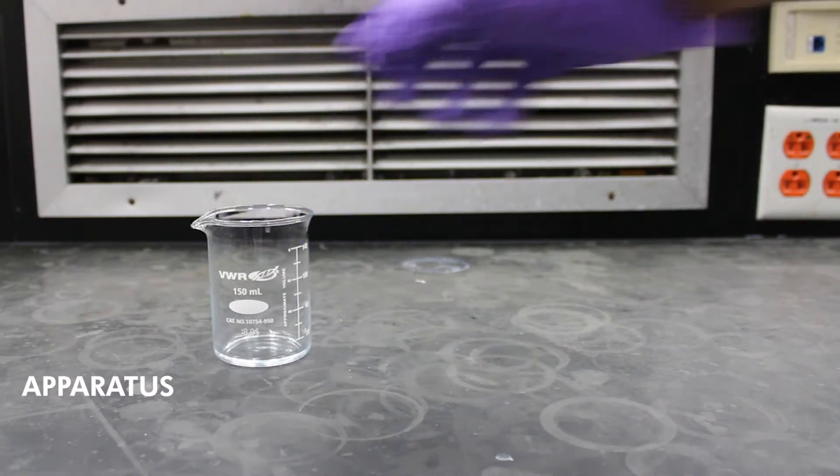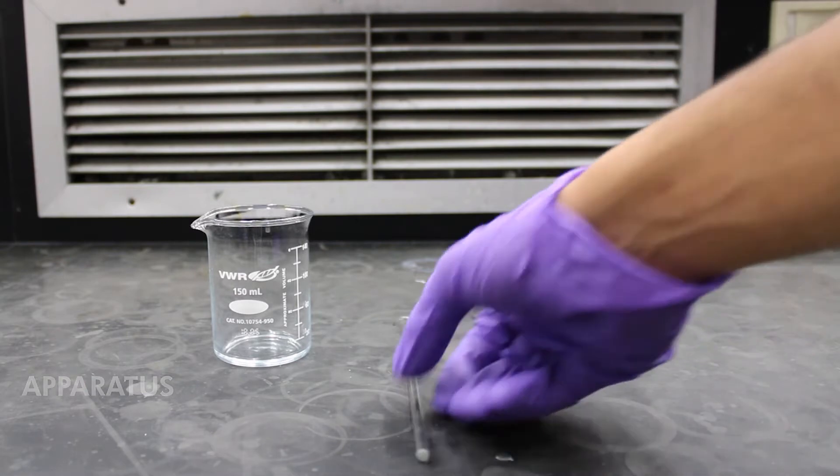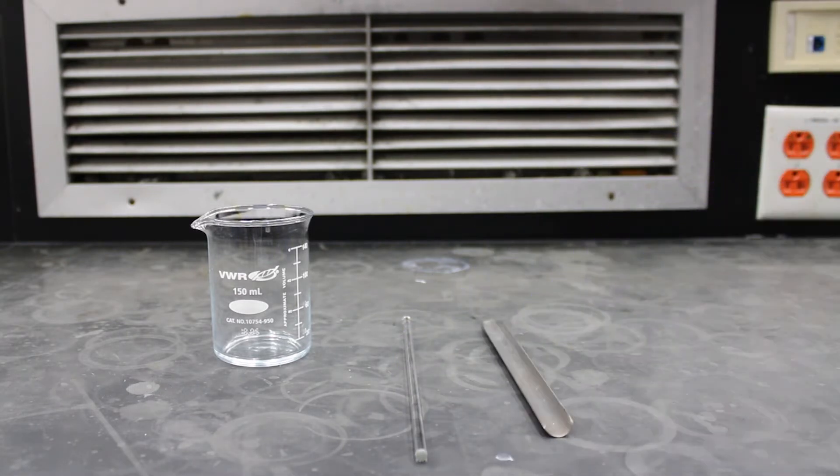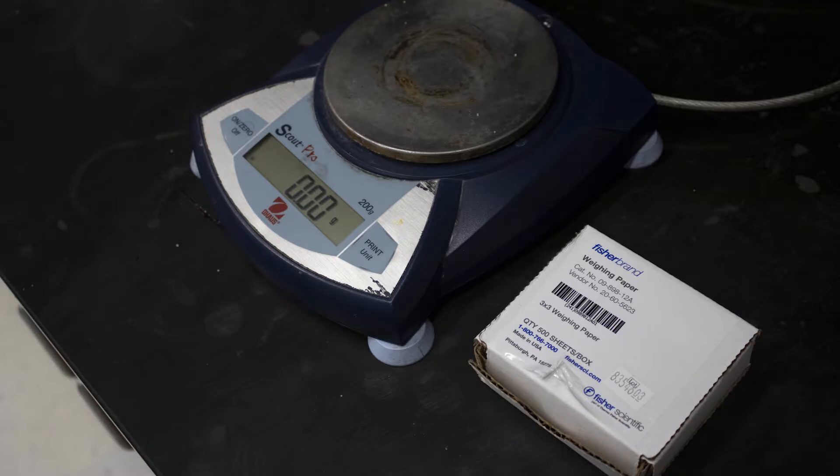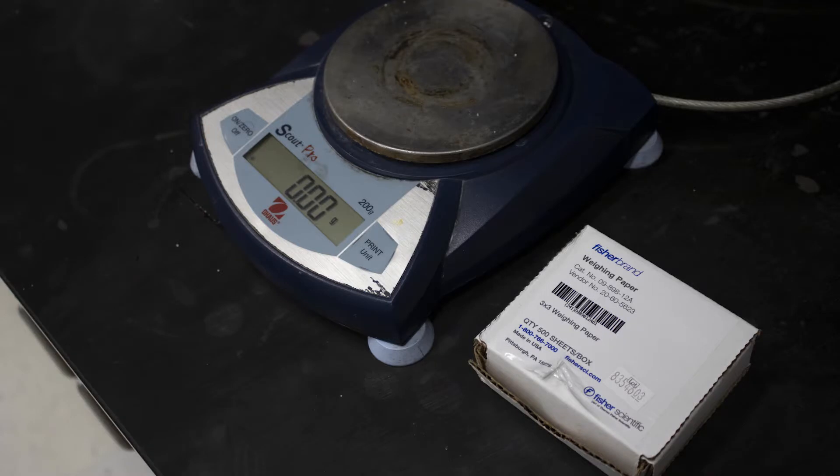For this experiment we will use a 150 ml beaker, glass rod, spatula, and a 50 ml graduated cylinder. You will use the common weighing scale and the weighing paper provided.